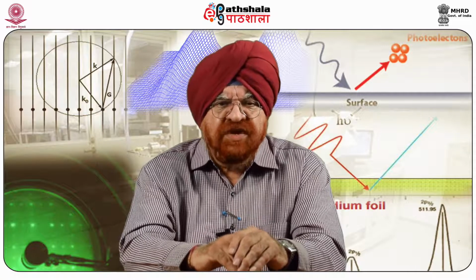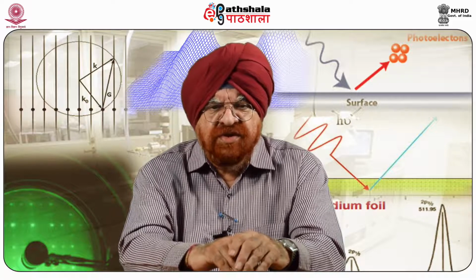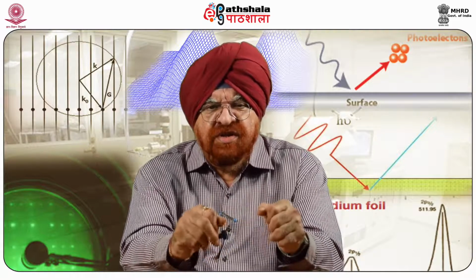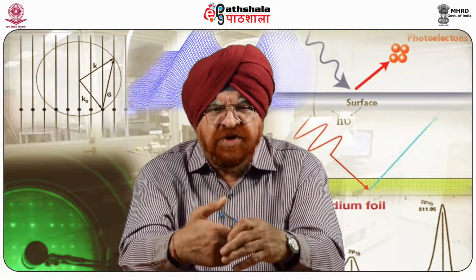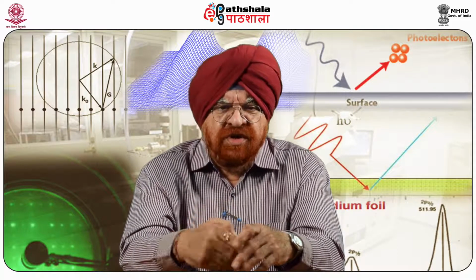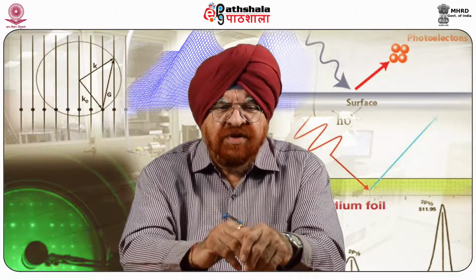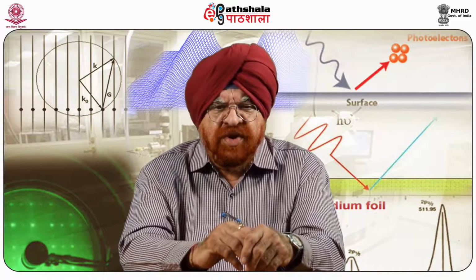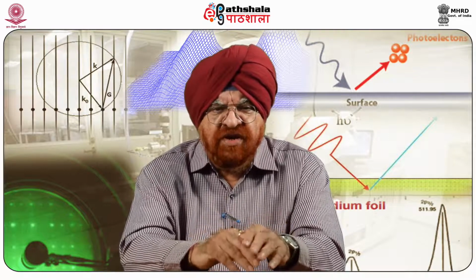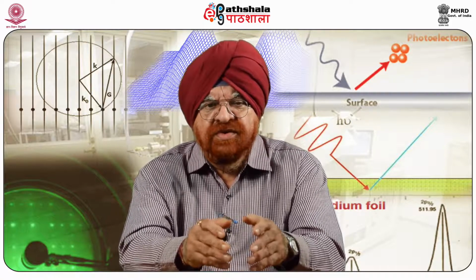Results. As confirmed by the Raman measurements, as the thermal annealing advances, the SiMn samples show crystallization signals along with the growth of randomly dispersed sub-micrometer structures on the surface of the film. These structures are manganese-containing silicon crystallites surrounded by silicon crystals in all directions, amorphous silicon and the MnSi1.7 silicide phase.